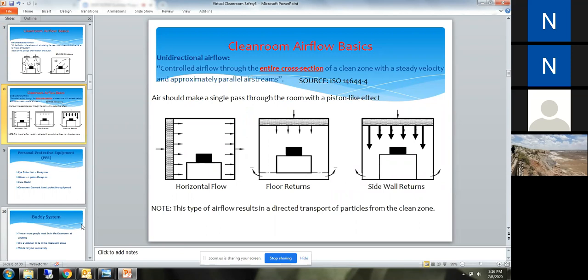You just want to see true airflow movement. In these slides, even though this is horizontal, you can see it's unidirectional, probably the same speed or about the same speed of air movement. Therefore, the particles are being washed away from the air, and then the air recirculates.